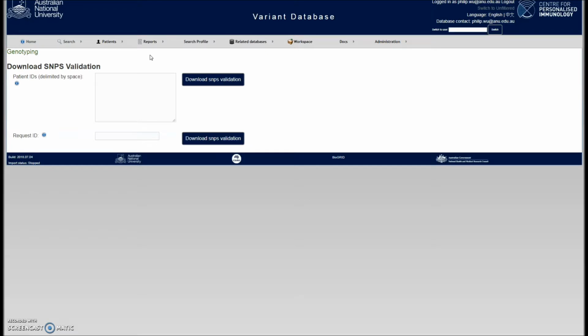And so we've created a tool that can be invoked through our web portal to determine the smallest combination of SNPs required to uniquely identify a patient within a batch for a predefined SNP panel. And so this process requires that a BAM file be available and can take a while depending on the size of the batch. So let's open up an example.